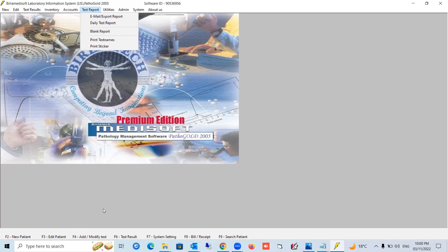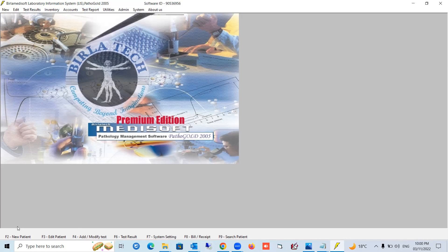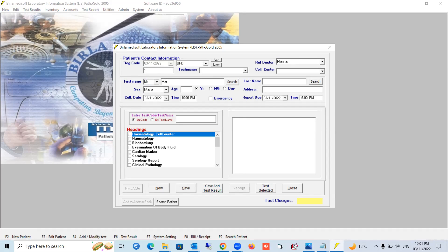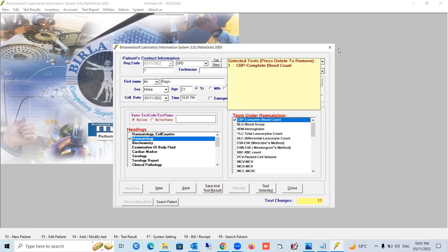Let's enter one patient as a demo. Press F2. You are now on the patient registration screen. There is a doctor name field — by default 'Self Doctor' is selected. Select the title — Mr., Mrs., etc. Enter a patient name, for example Rajiv Saxena. The gender 'Male' auto-fills. Enter the age. Then select a test — for example, Hematology Complete Blood Count.